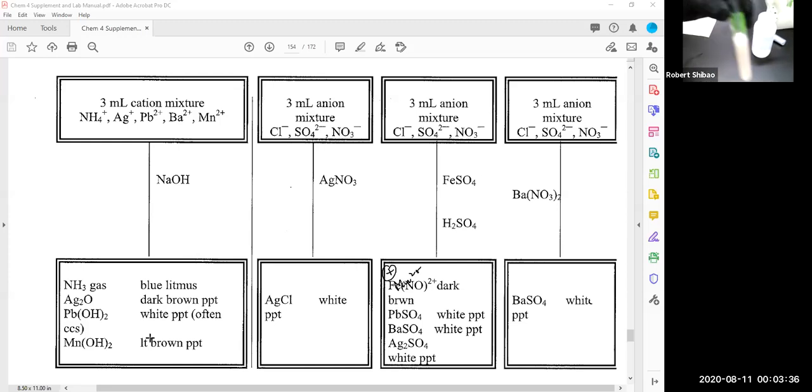Okay. Now I need to add my concentrated sulfuric acid. This is going to be in this jug here. Let me set this down here. The concentrated sulfuric acid is 96% sulfuric acid, 96% by mass. 96% by mass means we have 18 moles of sulfuric acid per liter. And so this is really concentrated. This is what turned the sugar into charcoal. Okay, I don't know what that is on the bottom. There's some stuff on the bottom of this.